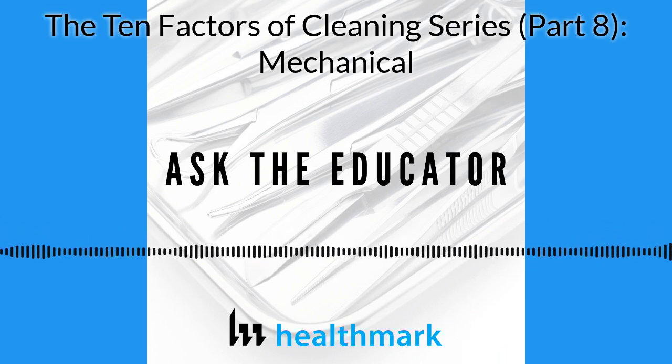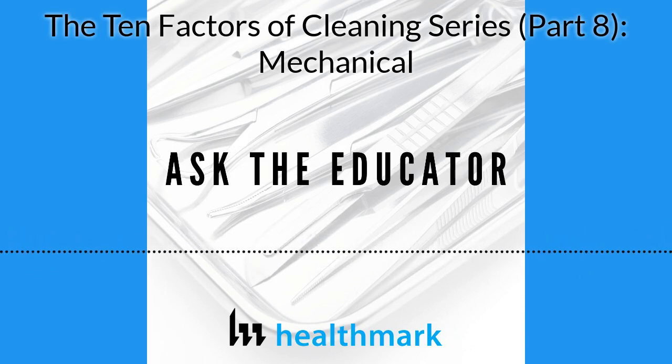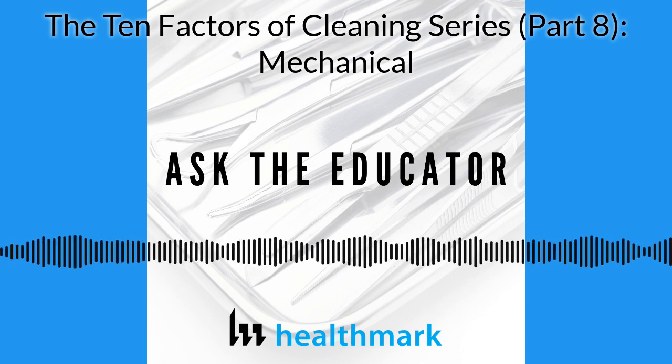Well, that's really interesting because when you look at how a washer is made, there are two theories. There's the European theory, which is more low impingement, a slower whoosh, whoosh.